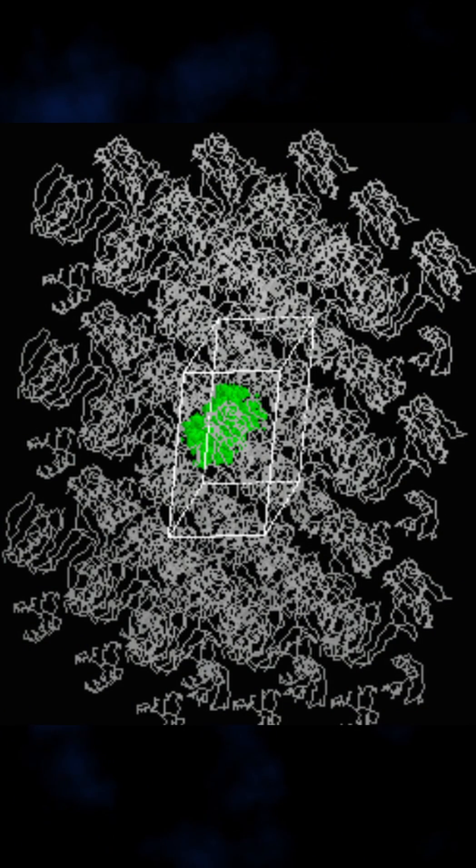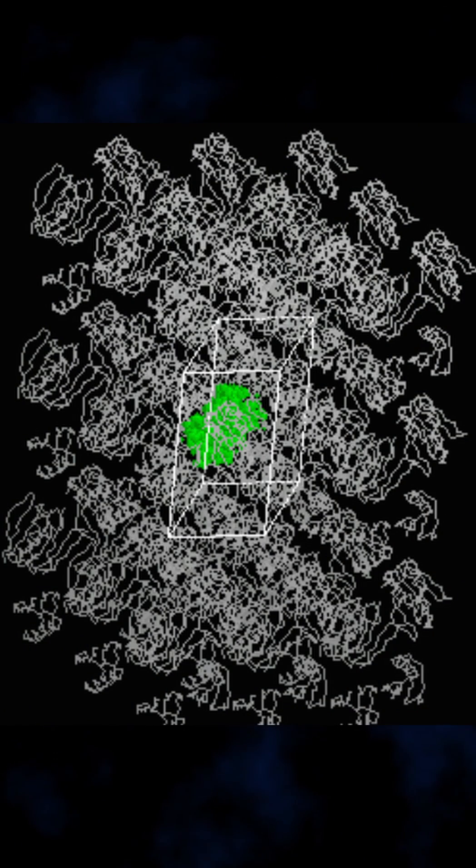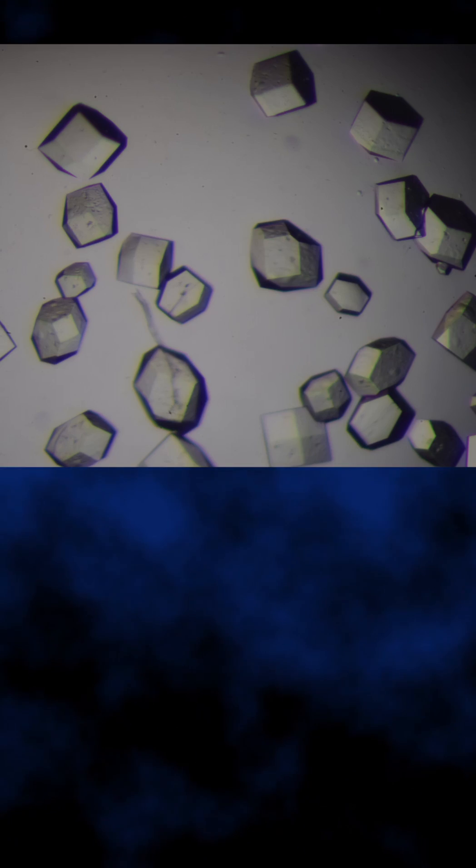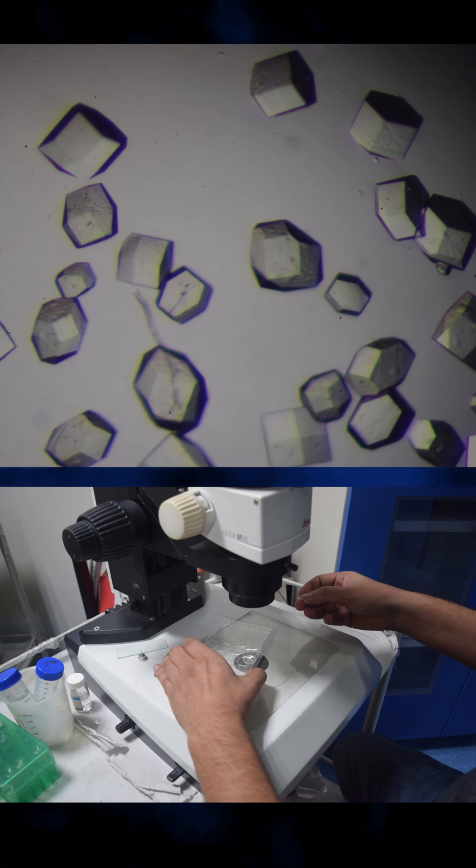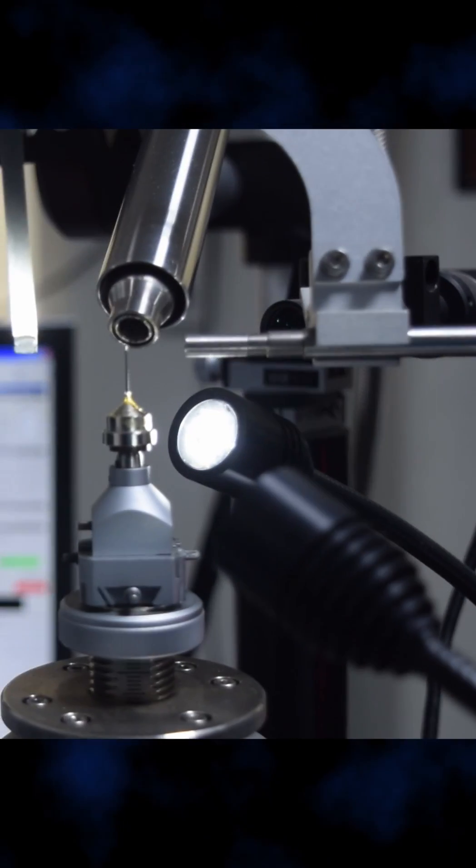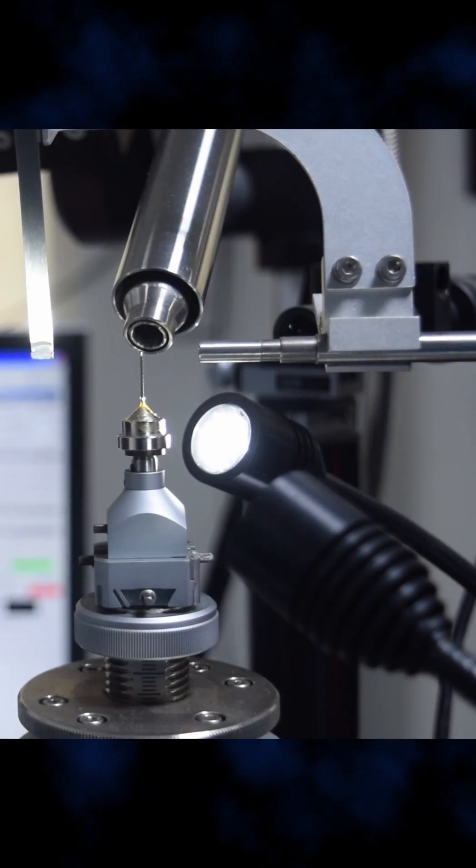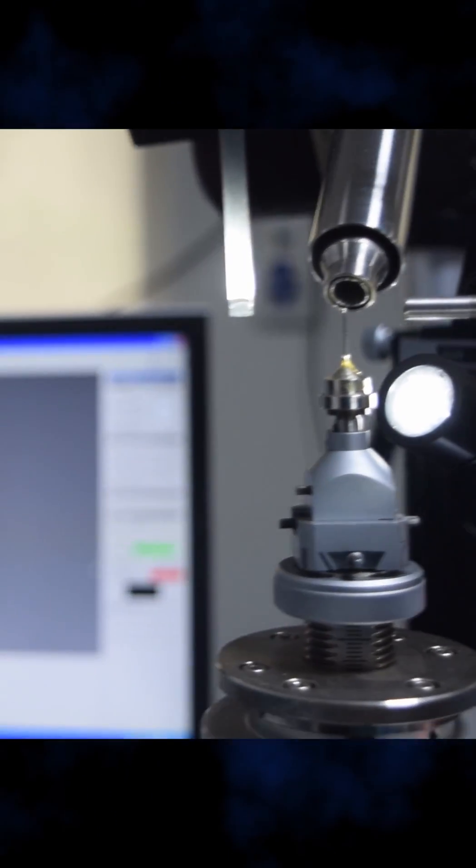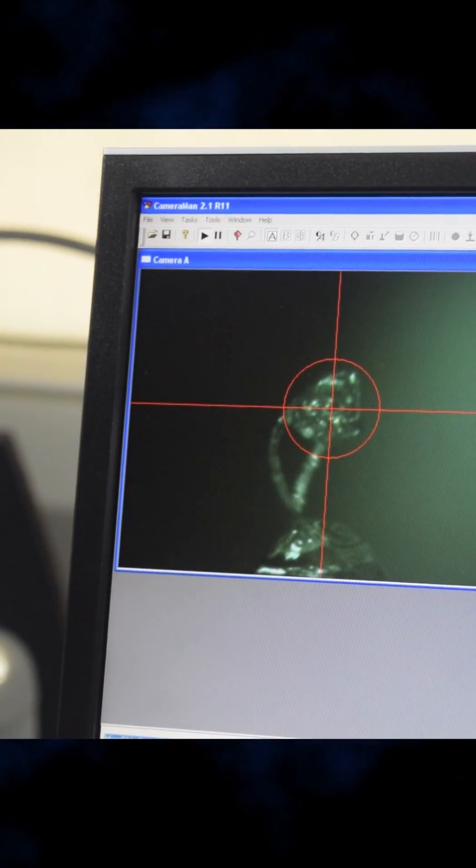The first step is to get the protein in a crystal form, which will be like this when looked under a microscope. Crystal is placed in the loop, mounted on the sample holder and adjusted to align with the X-ray beam.